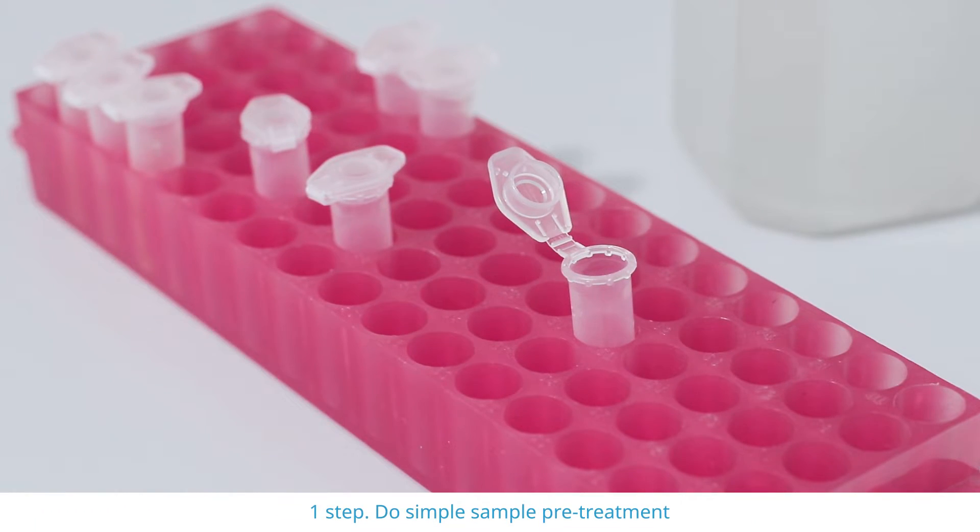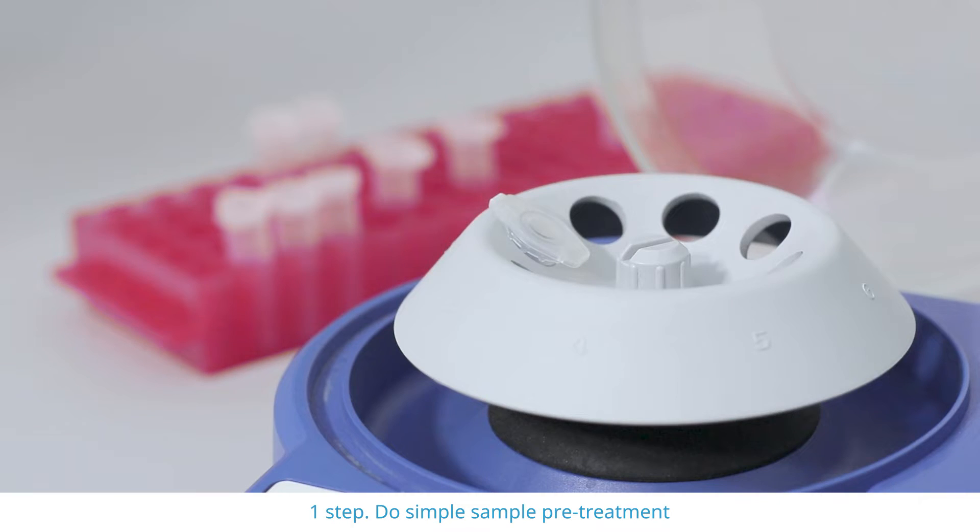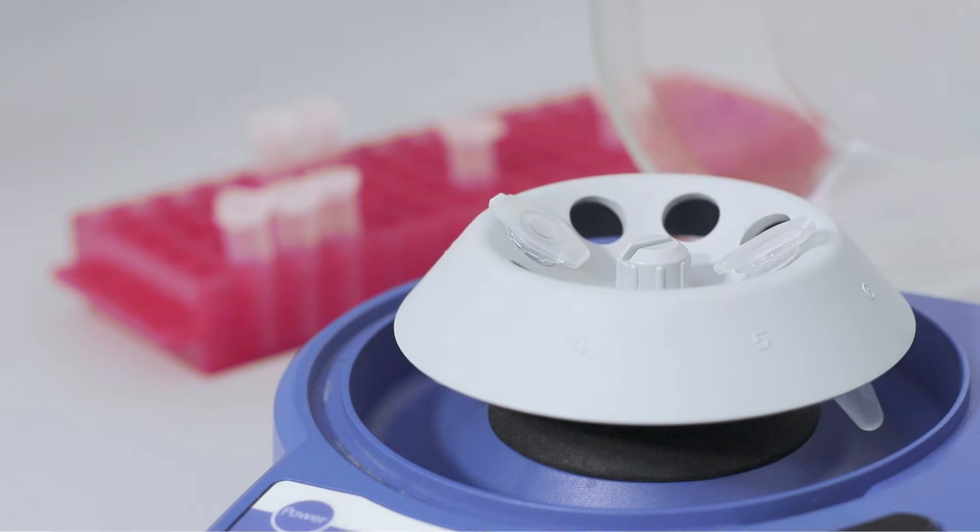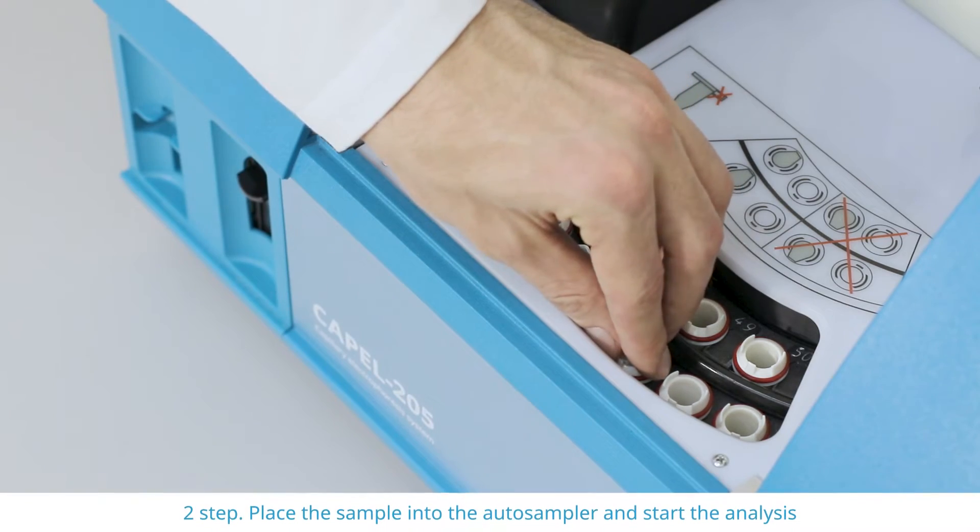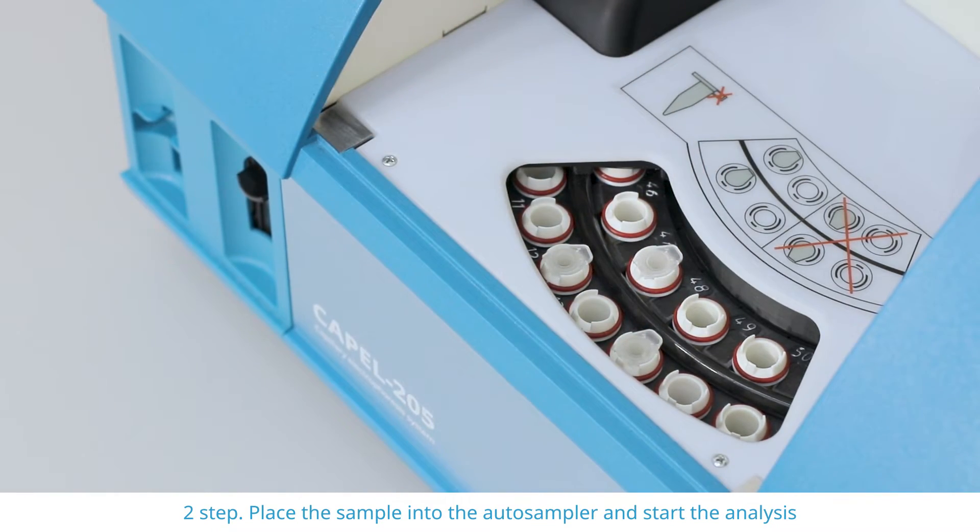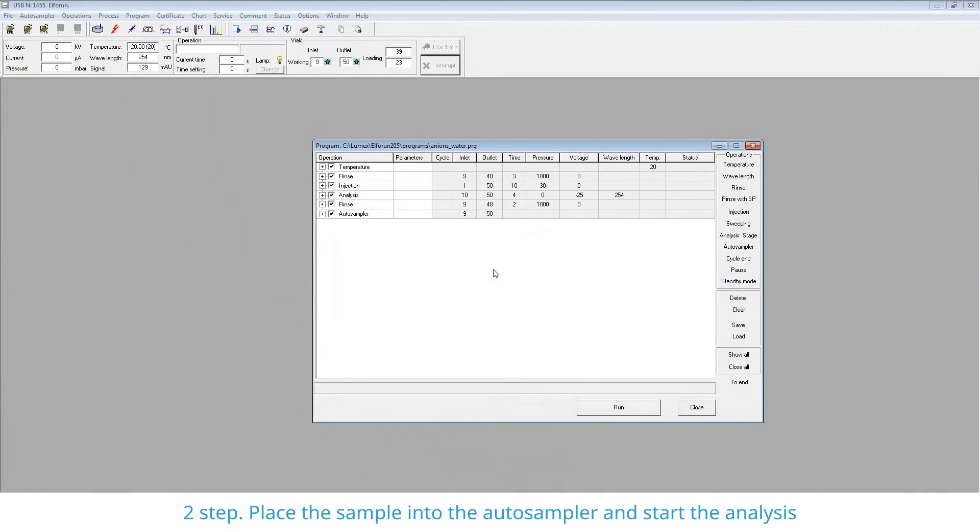The sample pretreatment usually consists of just filtration, dilution if necessary, and centrifugation. Then we place the centrifuge tube containing the pretreated sample directly into the autosampler and start the measurement.